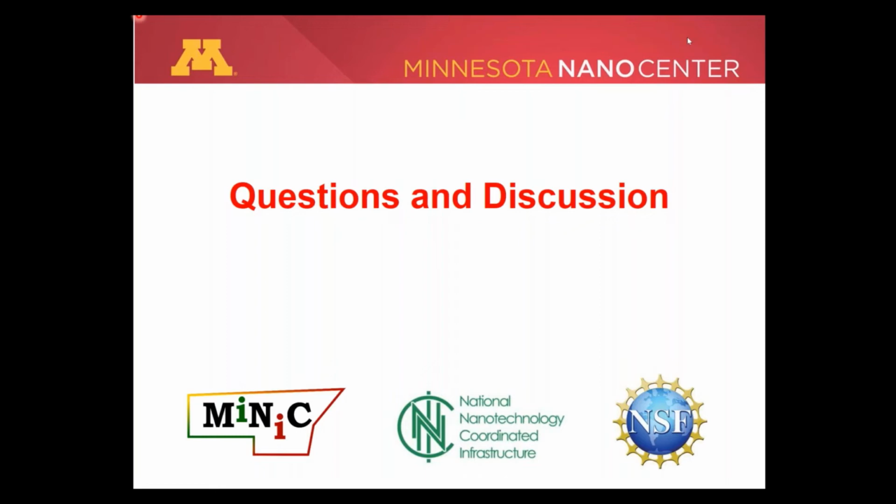Right, right. Next question is, will colored dissolved materials interfere with particle size measurements? So if we're measuring, say, biological particles in a growth medium that's red or something like that, I imagine it would. I think that's what she means. Yeah, there's definitely going to be some absorption depending on the laser light wavelength and the absorption properties of the liquid. So this is a case where if you can get by with dilution, with serial dilution, and try to clarify that suspending continuous phase, I would try it.